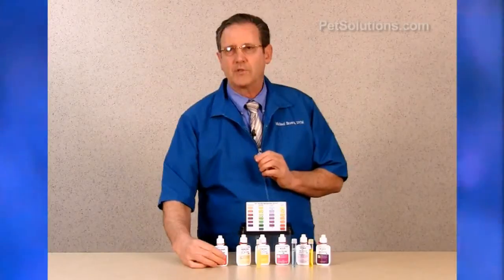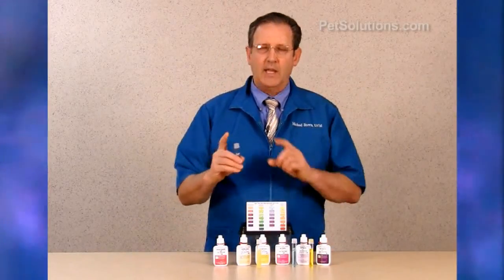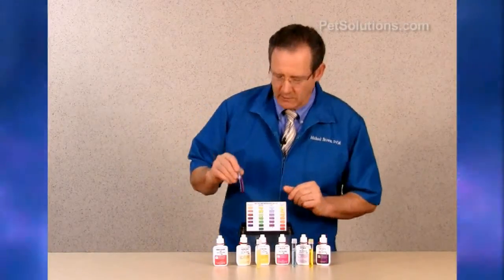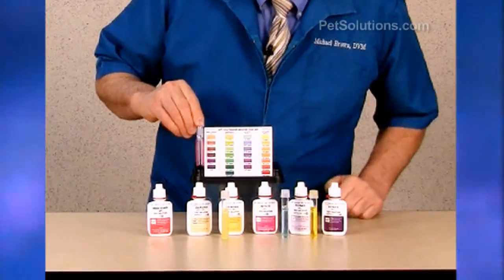Add 5 drops of the solution, cap it, and invert it. Do not use your finger as this could affect the test results. Then compare on the color chart — this one is about 8.0.